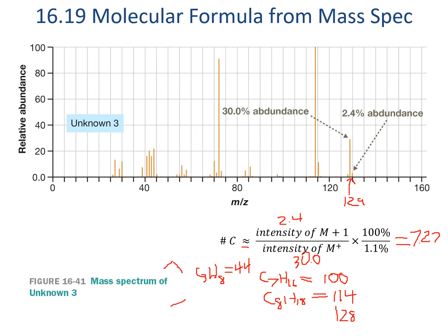If we put a nitrogen instead of the carbon, we'd have C2H6 from the carbon, but we have the N always comes with the H as well, because it can have 3 bonds instead of 4. And so even though nitrogen has an atomic mass of 14, it always comes in units of 15 because it brings along an extra hydrogen.